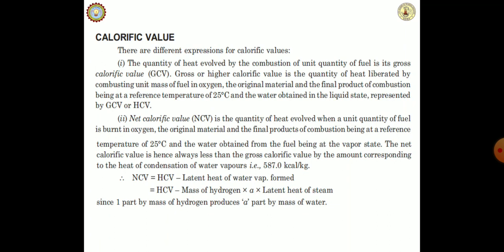The net calorific value is the higher calorific value minus the latent heat of water vapor formed.